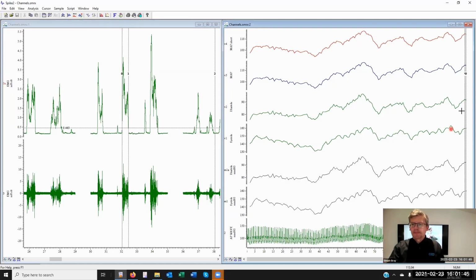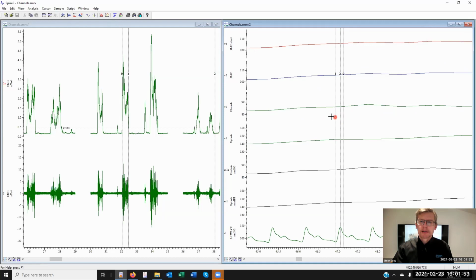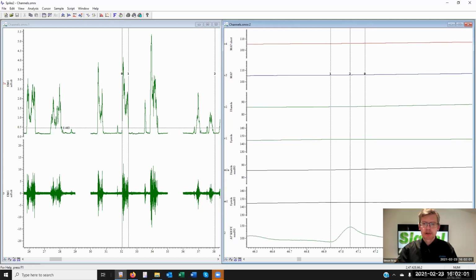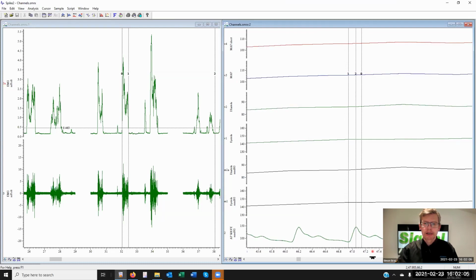Okay, so what did we do? First of all, I took cursor 0, and let's just put this in the center of the screen. Now remember that cursor 0 must move before any other cursors will update their positions. I'm using control and dragging the x-axis so I can see exactly what the display will end up like.